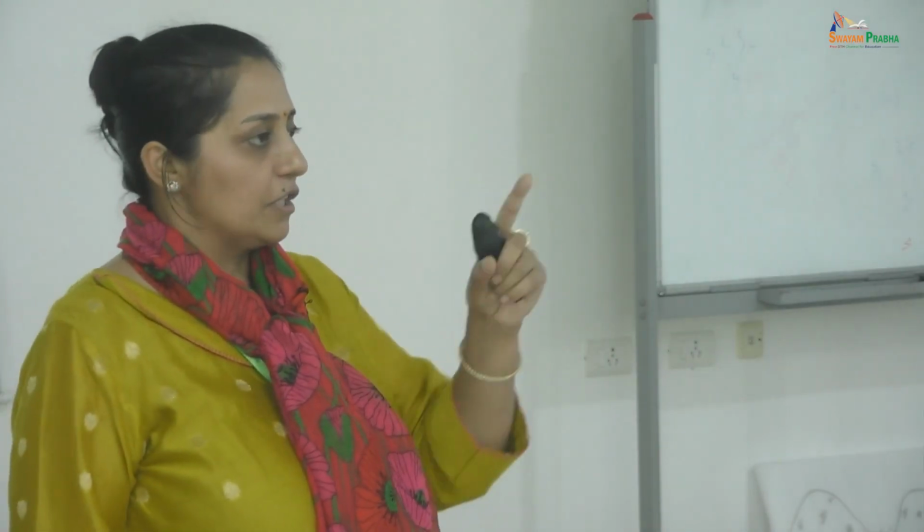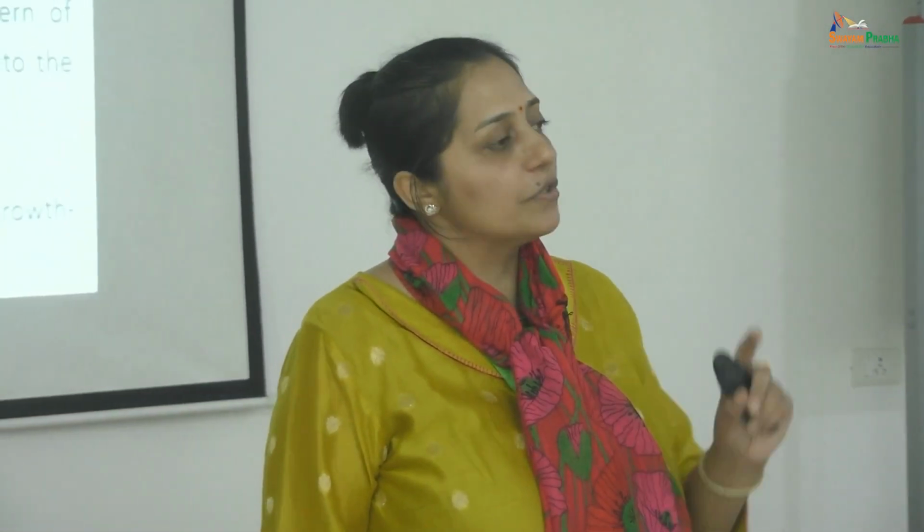I was talking about that once you had optimized the parameters, which included your initial substrate concentration, the media composition was optimized. You conducted a batch knowing that the limitation would be that, let's say, your log phase ends after 12 days. So after 12 days, you have reached a biomass concentration of X. If I want to improve this X to 2X, what choice do I have in the batch itself? Giving different substrate like diauxic growth or. But I have already optimized my choice of substrate earlier, no? No, I'm talking about the biomass.